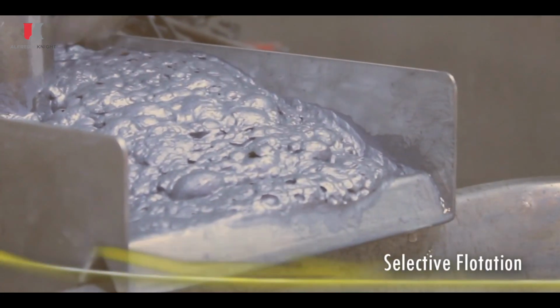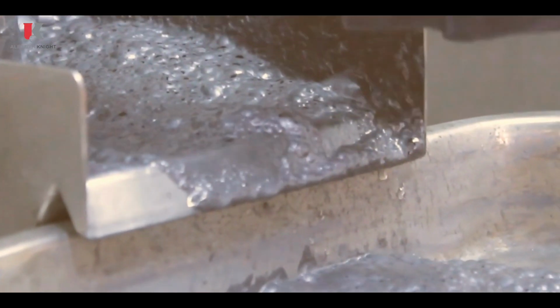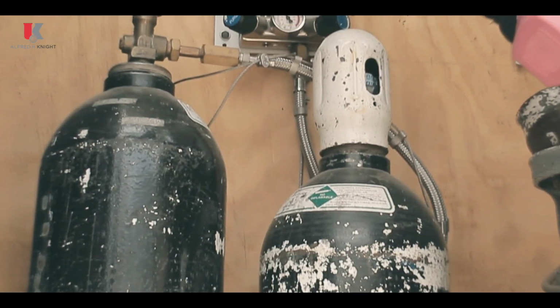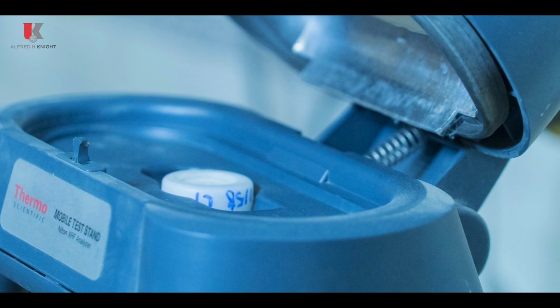Selective flotation. In this laboratory, the operating conditions of a selective molybdenum plant can be tested. Here, different operating conditions, pH, potential, reagents, gases, etc. are evaluated to obtain metallurgical indicators, such as grade and recovery.